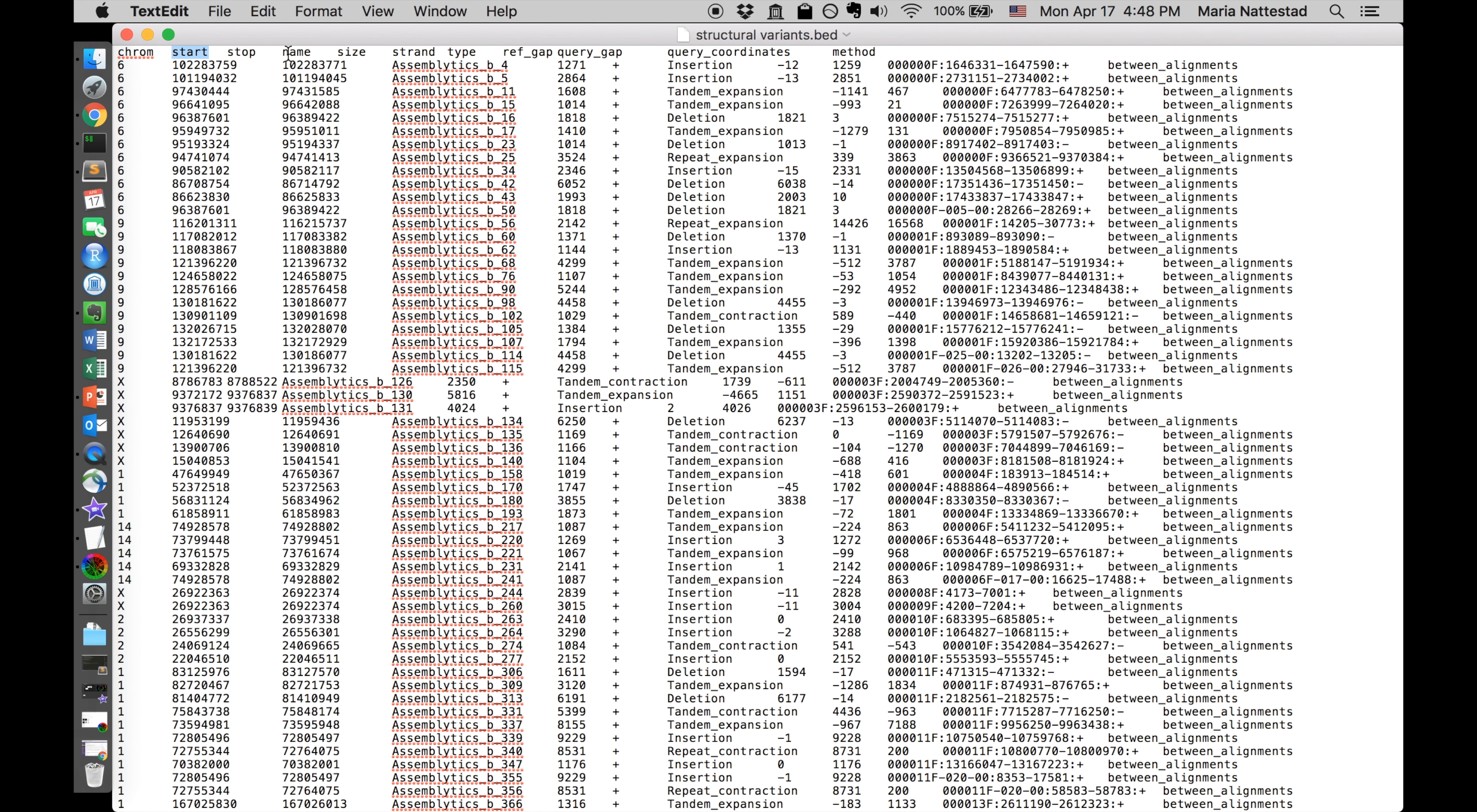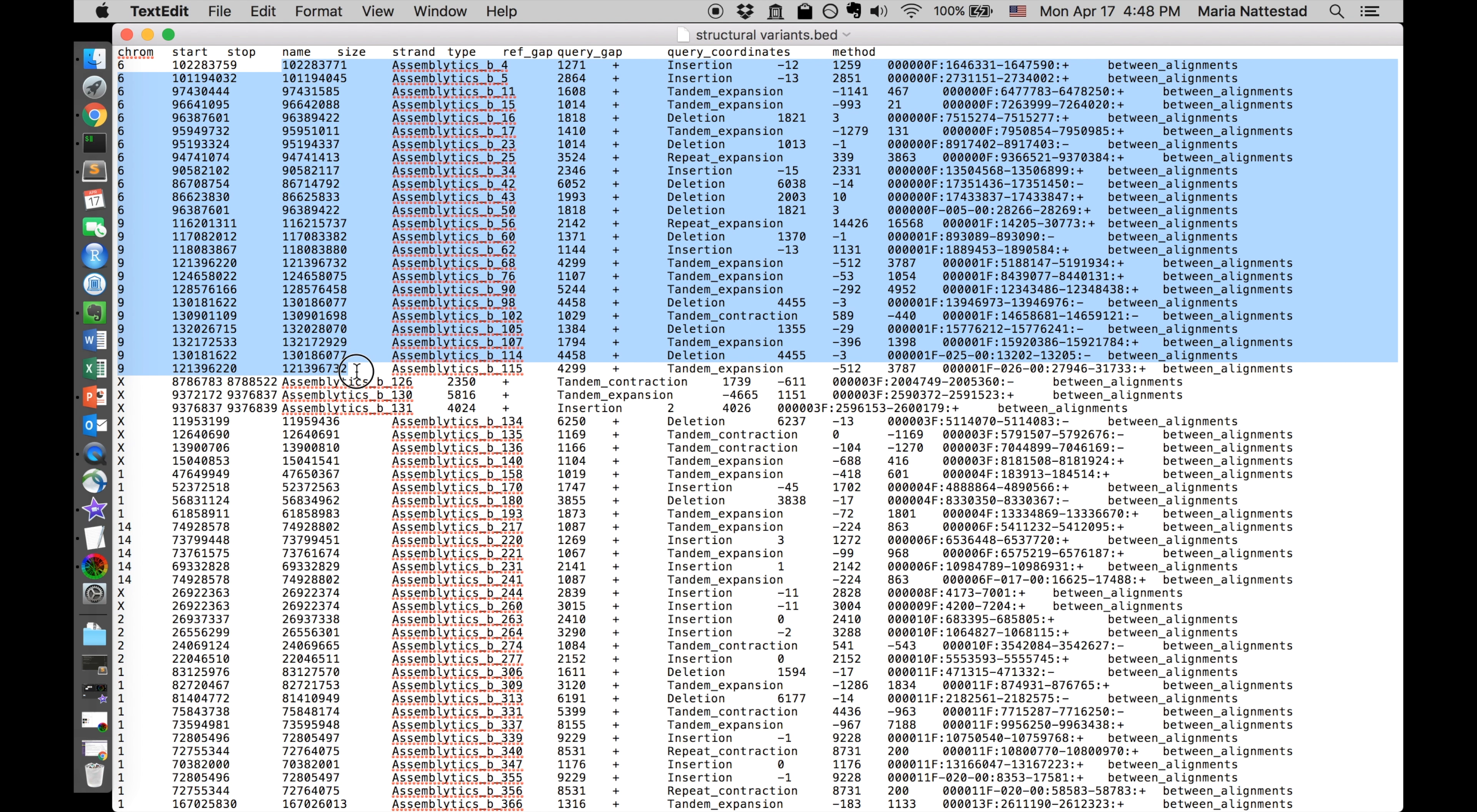The columns are variables but the rows are the things you're plotting. So if you're doing a scatter plot you'll get one dot for each row. And if you're doing a line plot you'll get one point on the line for each row. Same thing with an area plot.